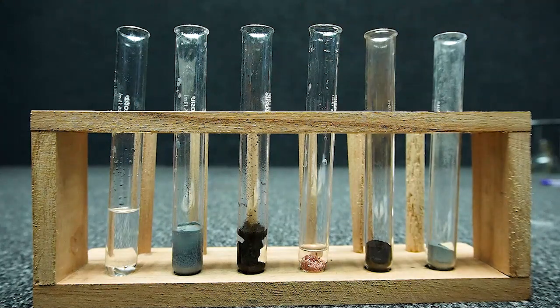So you can observe in all the 4 test tubes there is no change in the color of zinc, aluminium, iron powder or copper. It indicates that aluminium is not displaced by zinc, iron or copper.